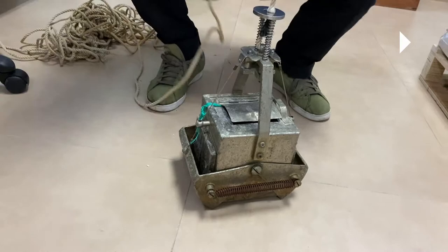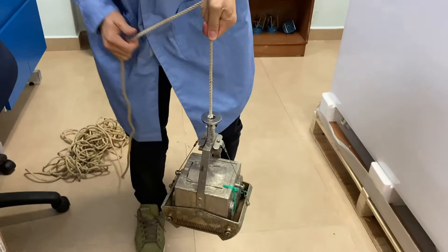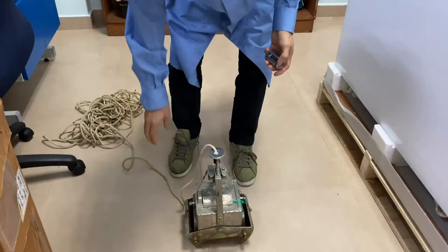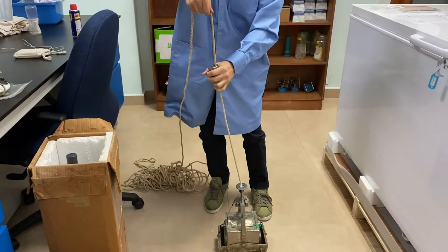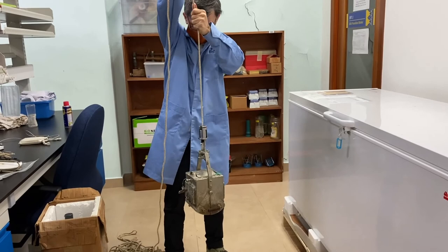Okay, so now you can see that it is opened and ready for sampling. This is the messenger. Once it has hit the bottom of the sea, you release the messenger and it will capture the soil.